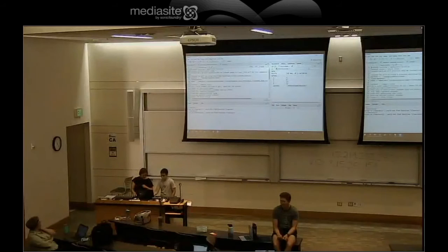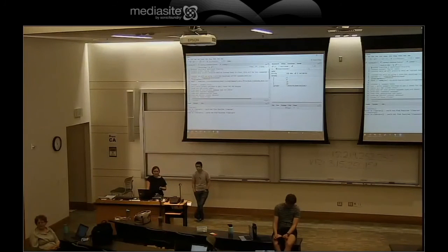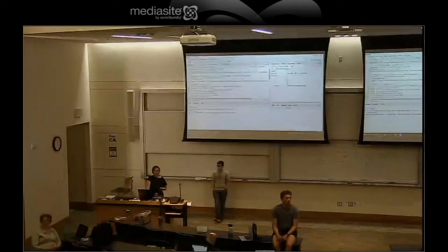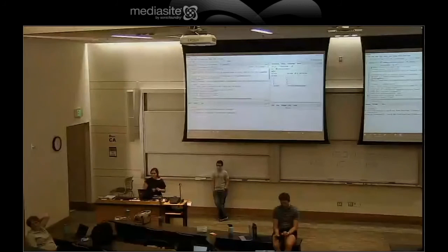Learning R, additional practice. So where I have in this file the data and a full path to where this data is, you'll just have to put in the path to wherever you download this CSV file. In other words, you're downloading the R script and the CSV, but then you have to change the path so that it points to the CSV. That's what I suggest you do before you leave, to make sure you can read that data file. Once you can read that data file, the rest of the homework should be easy.